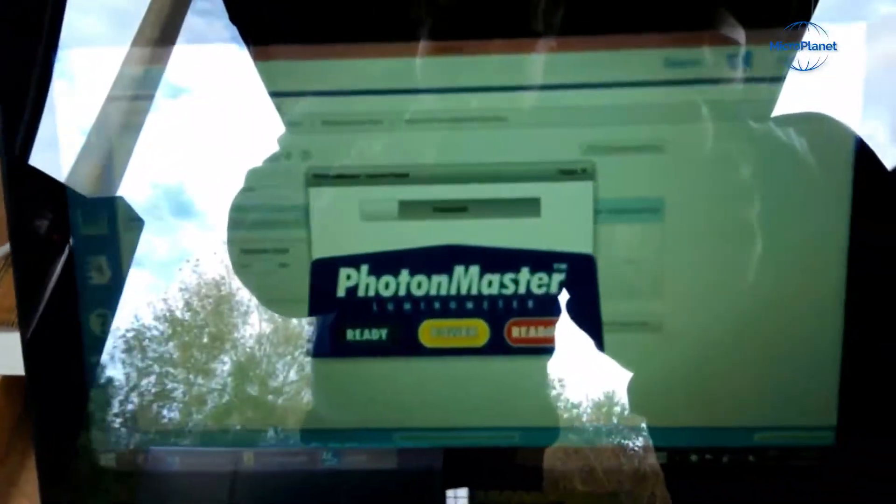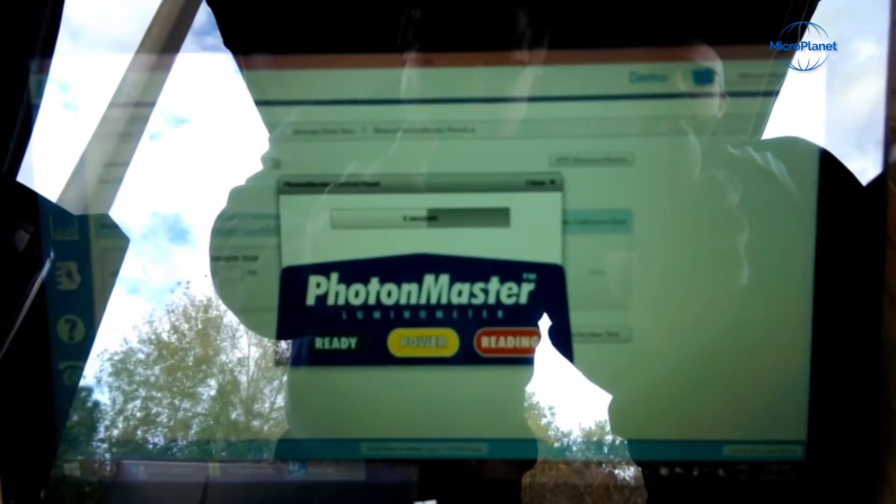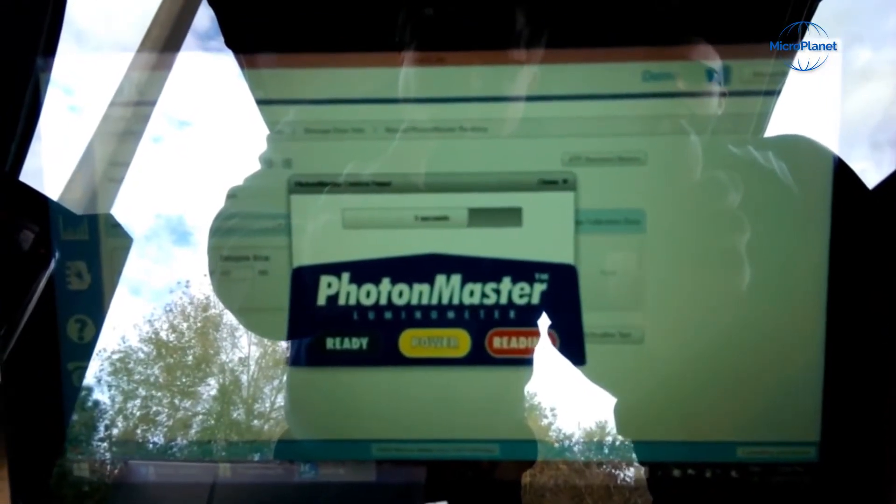And a reading is taken from the LumiCalc software.